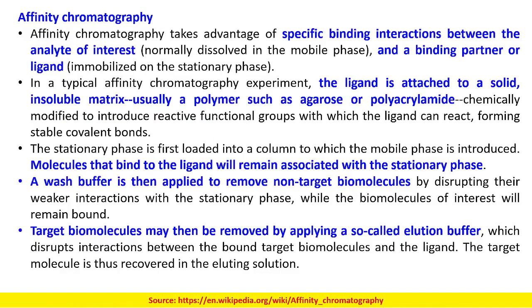Affinity chromatography is just like this anion exchange. Over here we can have an analyte which has a particular affinity for the stationary phase. Say for example, immunochromatography. You have the stationary phase, and you may functionalize the stationary phase with the antibody. Then you can have the antigen.